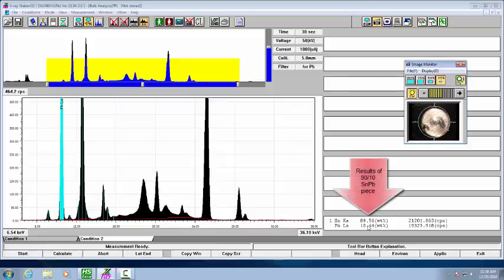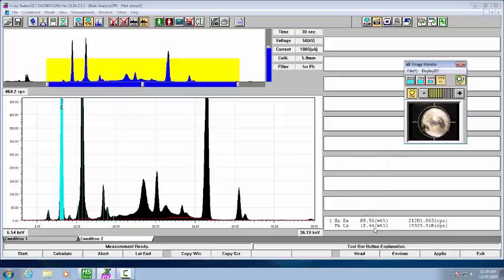You'll see the results down here: 89.56% tin and 10.44% lead.